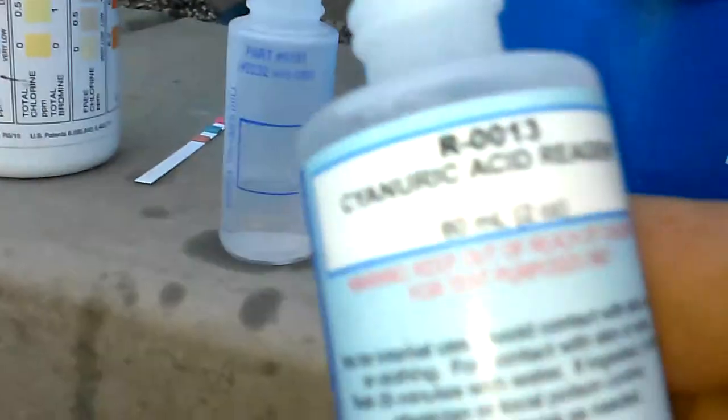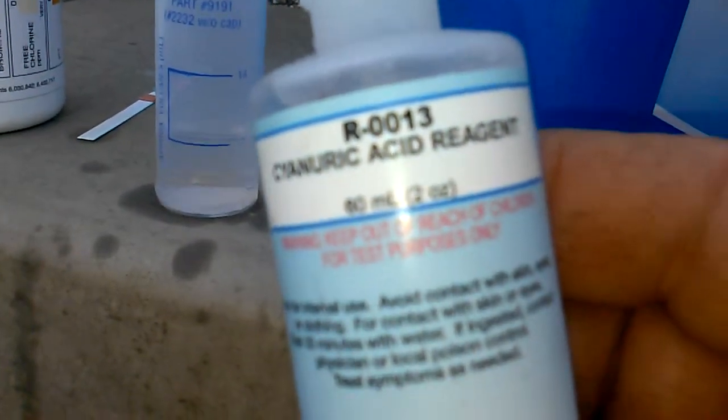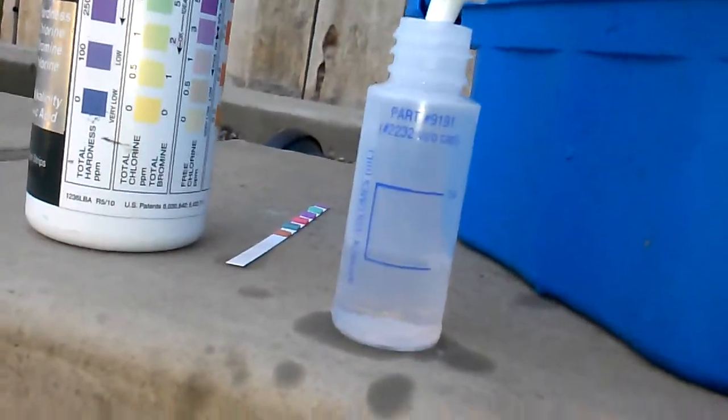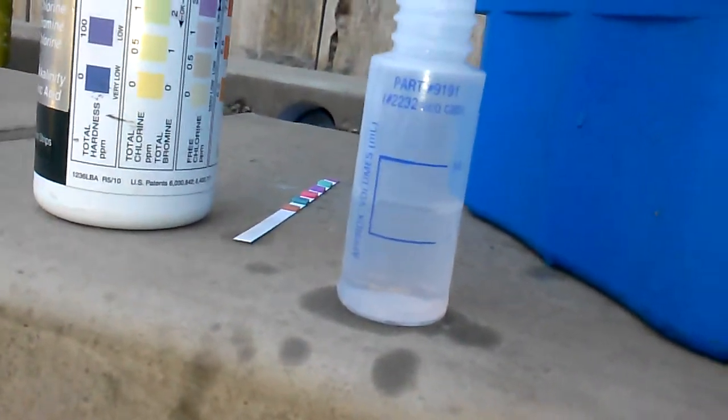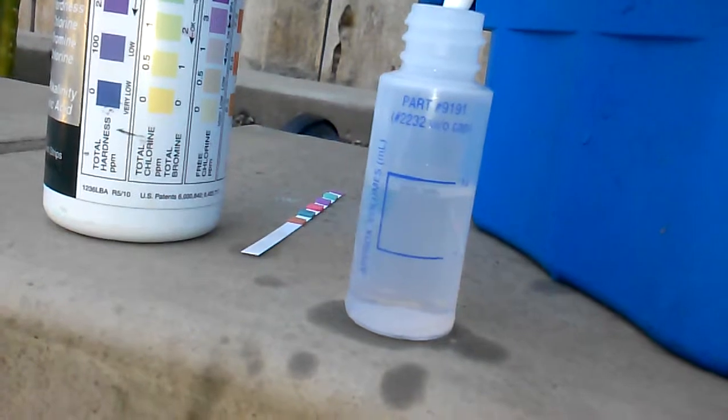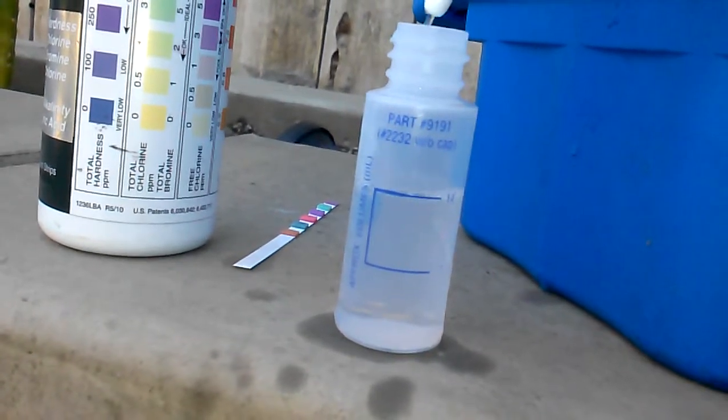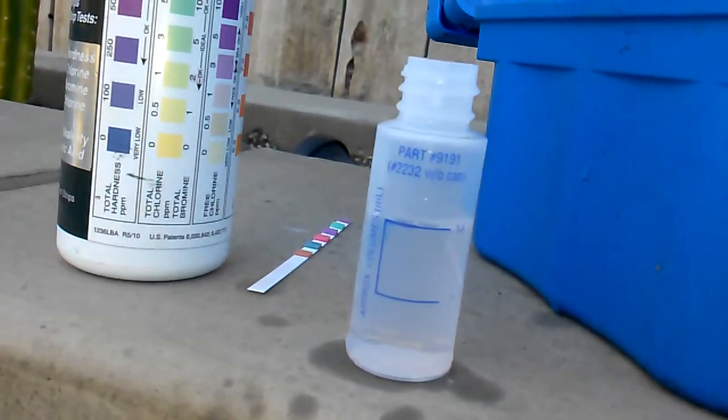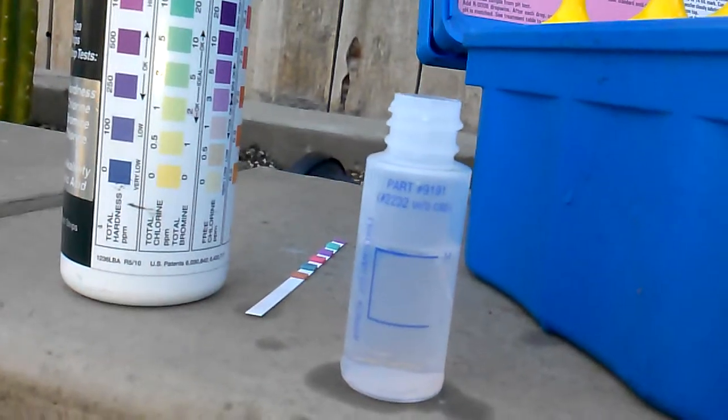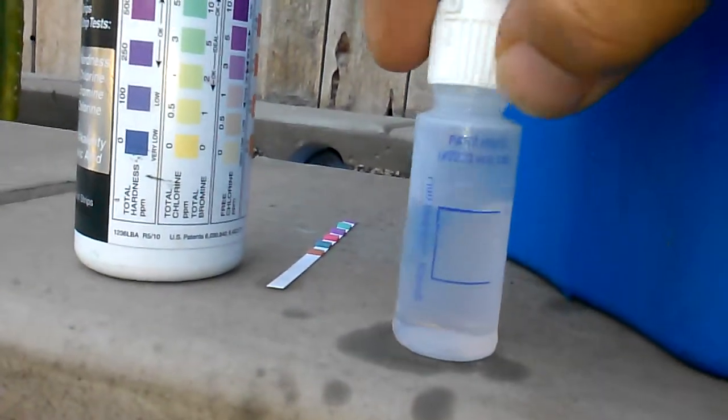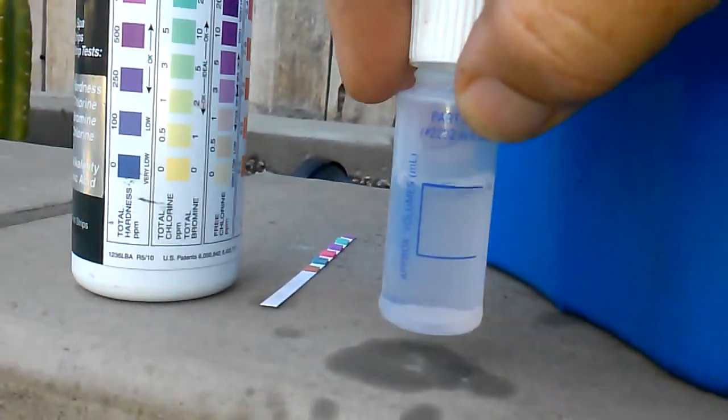And then I've got the R0013 cyanuric acid reagent. What we're going to do is we're going to fill up the vial until it's up to the next line. So basically it's half water, half the reagent.